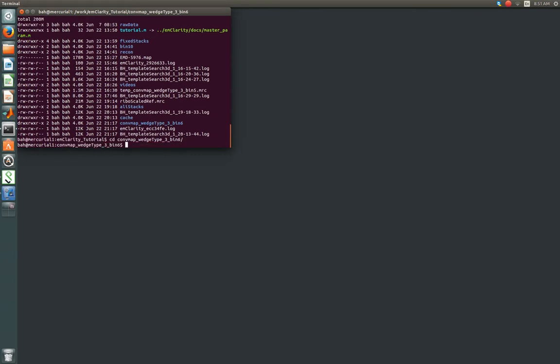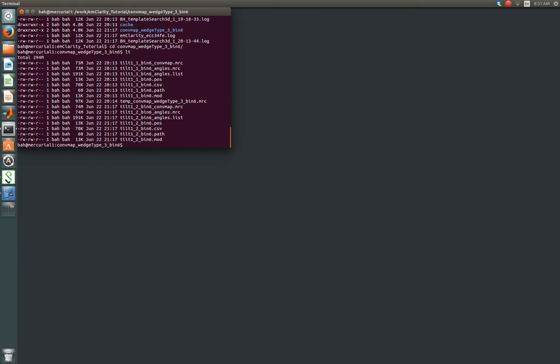So we're going to change directories into that convmap, and then list our contents, and we're going to open up a couple different image files to help us decide how we want to edit.